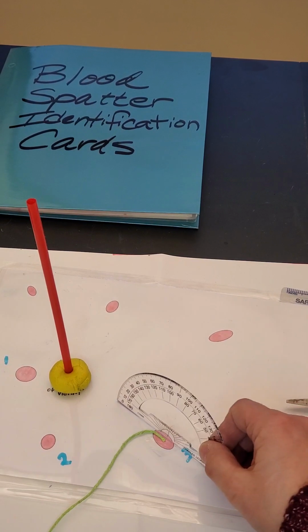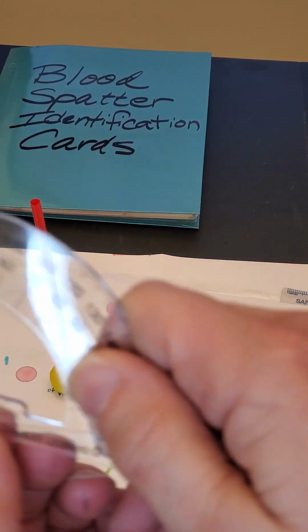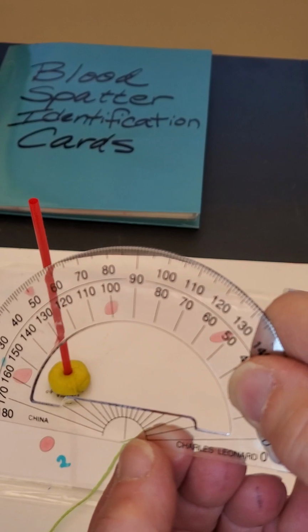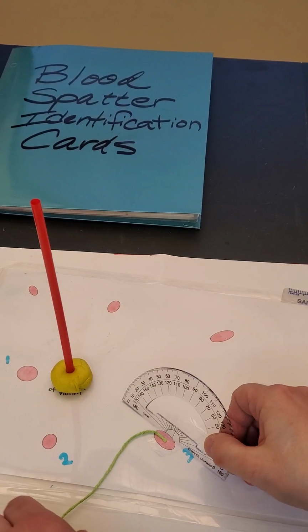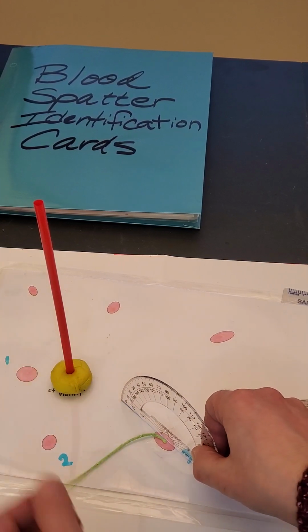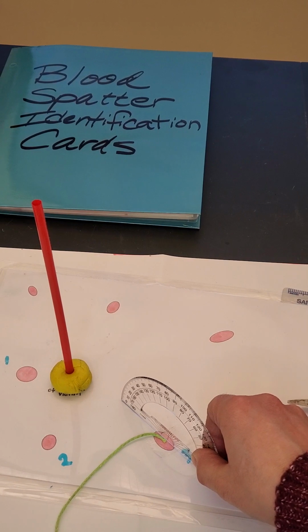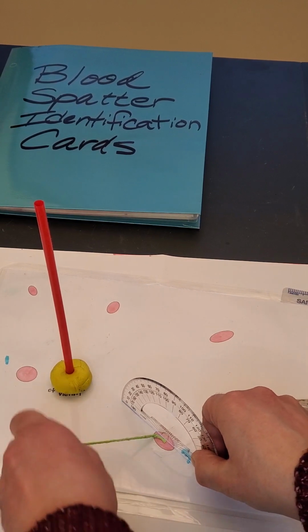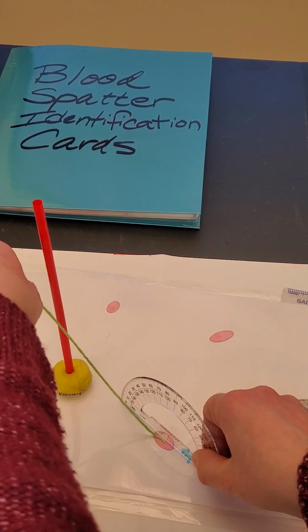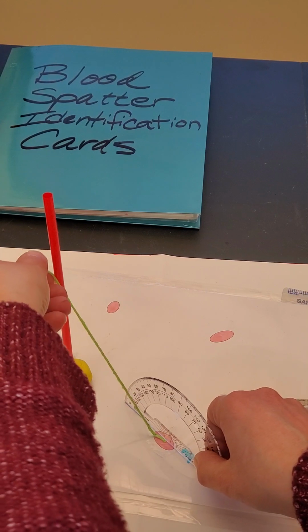It's hard to do this by yourself, but take your protractor and line it up to the center of the drop, to the center point here. See the center point right there? That's where you're going to line it up, to that center string. You're going to say, okay, 39 degrees. Make sure that your protractor is facing towards the straw. 39 degrees is about here somewhere.